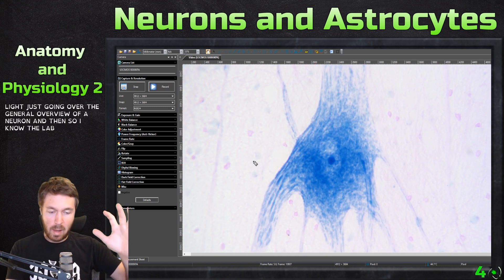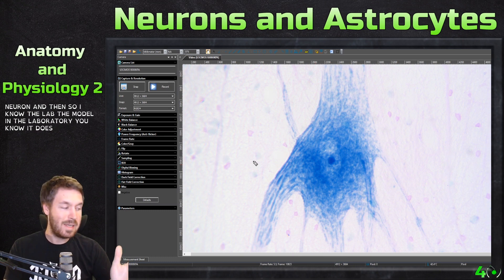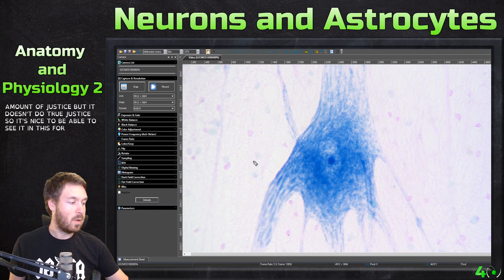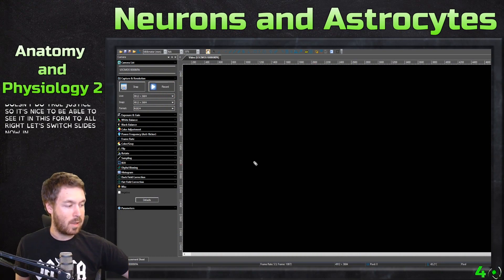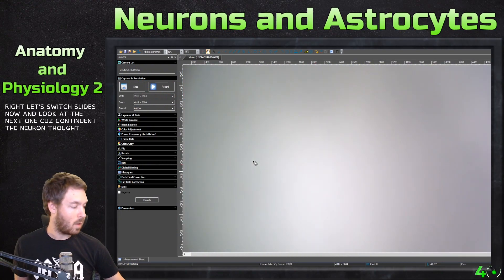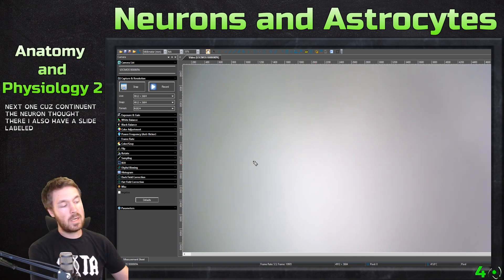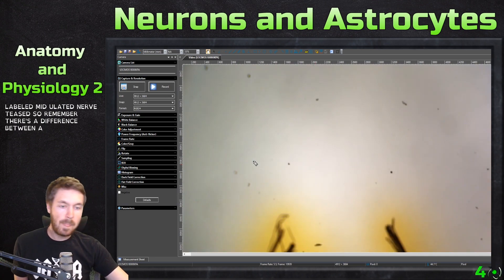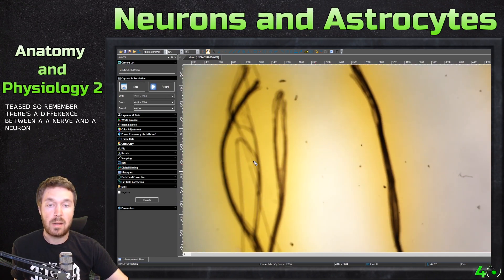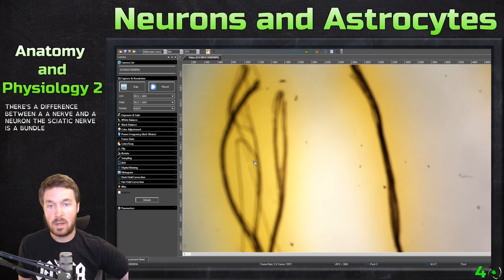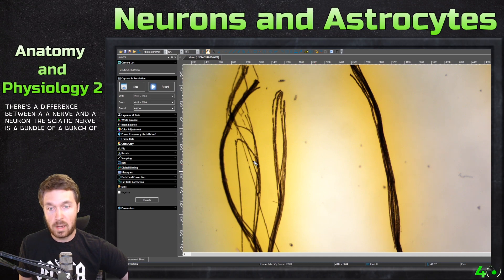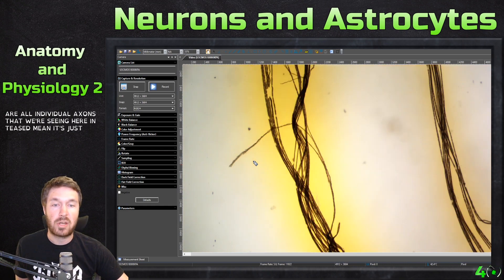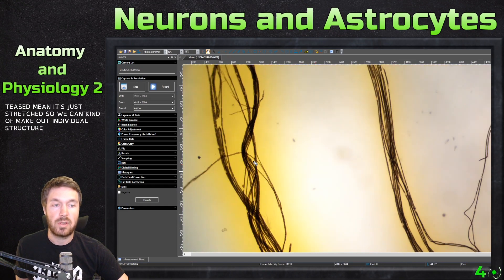The model in the laboratory does a decent amount of justice, but it doesn't do true justice, so it's nice to be able to see it in this form too. Let's switch slides now and look at the next one. I also have a slide labeled myelinated nerve teased. Remember, there is a difference between a nerve and a neuron. The sciatic nerve is a bundle of a bunch of neurons or nerve fibers — these are all individual axons that we're seeing. And teased means it's just stretched, so we can make out individual structures on it.